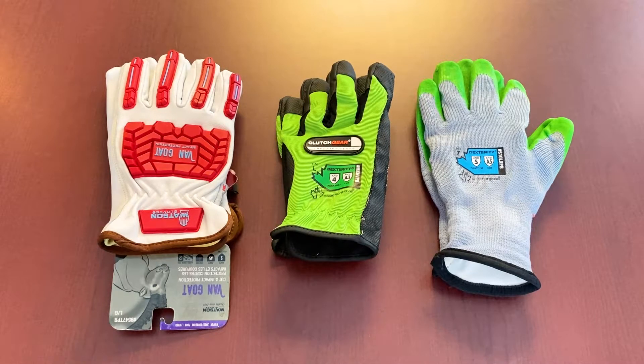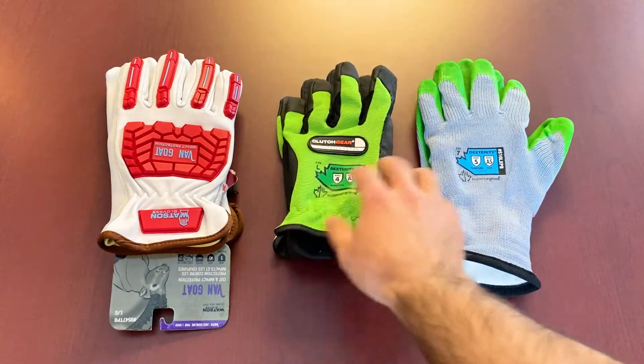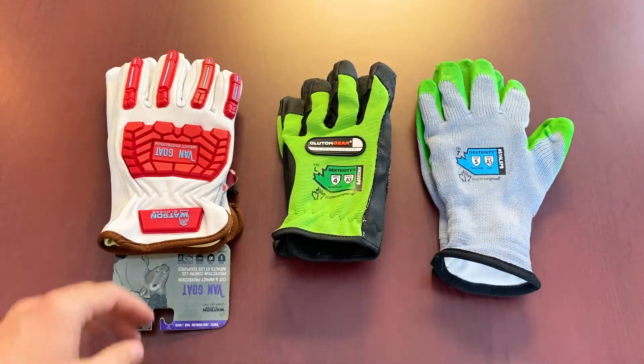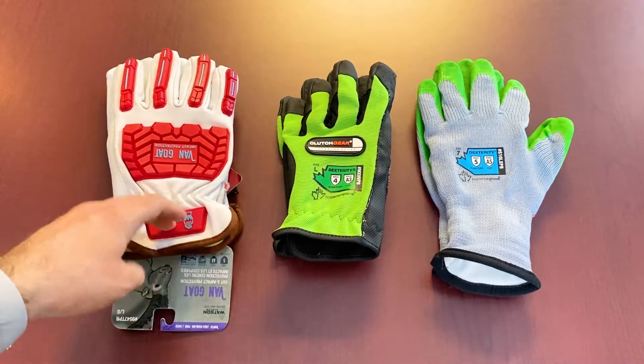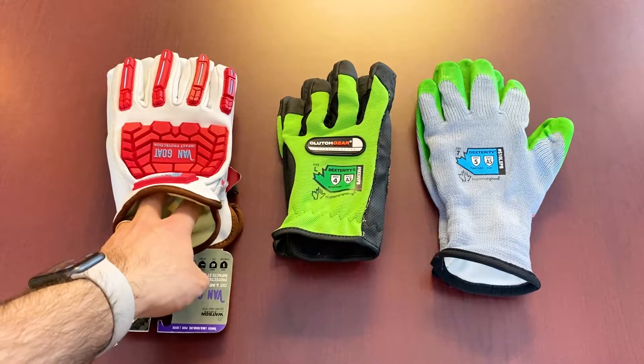Puncture resistance is something that has been surrounded by some ambiguity over the last good few years, even though the standard has been around for a little bit. Some of the things to mainly keep in mind when thinking about getting some puncture resistant gloves is how this rating is measured. We've got a couple of gloves here — you can see some of them have the rating on the back, and some gloves you're gonna find the rating deep inside a tag. This is an example of a glove that has the tag on the inner part.